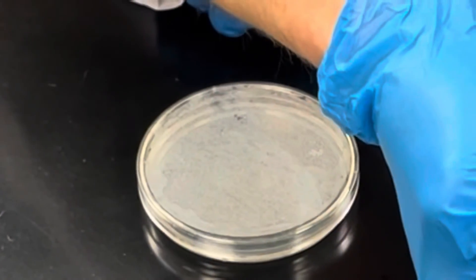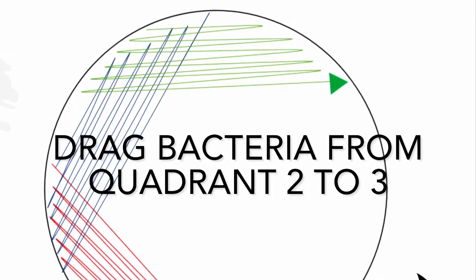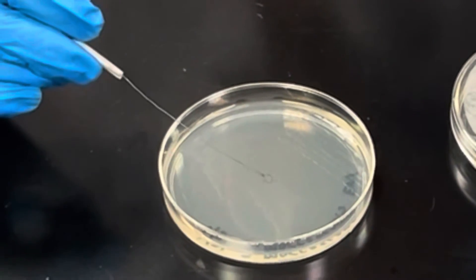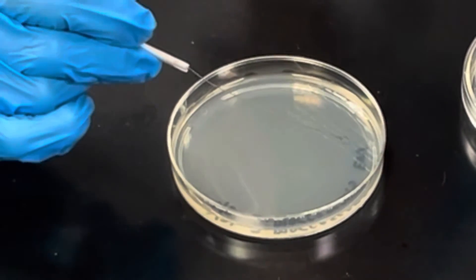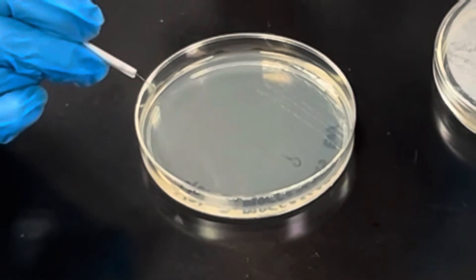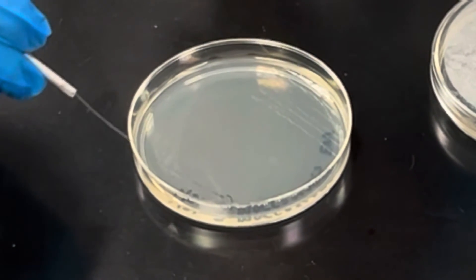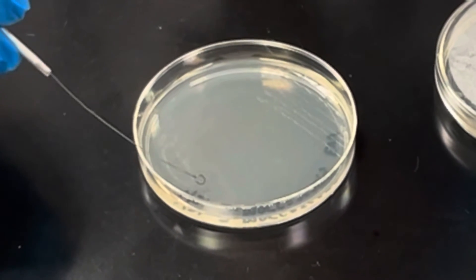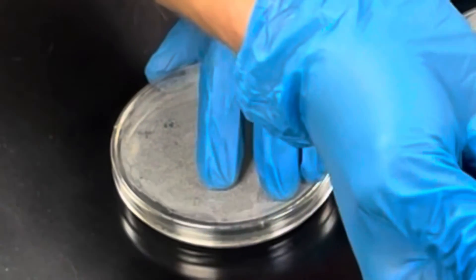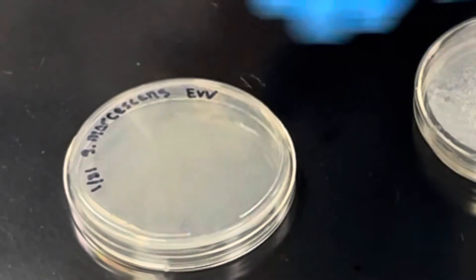Rotate that last quarter turn. There's a lot of room left on this plate, so we're going to go into quadrant three just two times — one all the way across, two — and then with the rest of the real estate just keep streaking Z patterns. The idea is that as you streak you are diluting the bacteria, and ideally you want isolated bacteria sitting by themselves that will form colonies and give you a pure culture. Always flame before you put your loop down on the lab bench, then flip your plate over and it's ready to incubate.